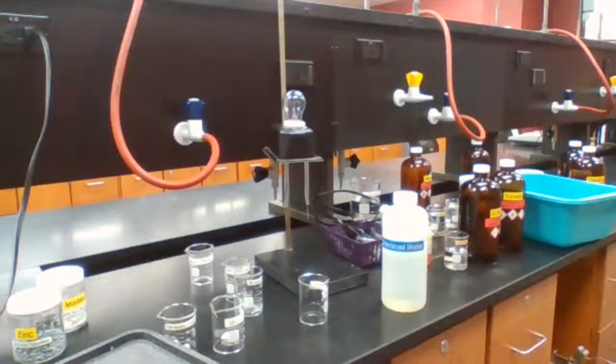Okay, I have to find it. Looks like we don't have it. I'm sorry, 6 molar HCl and acetic acid. Yes, one is hydrochloric, one is acetic.